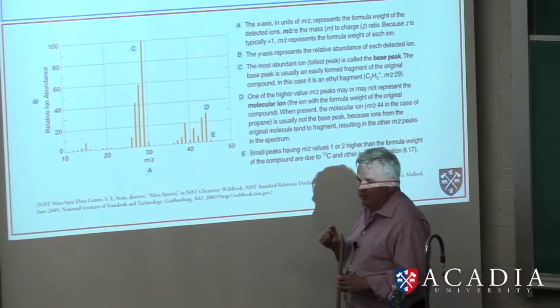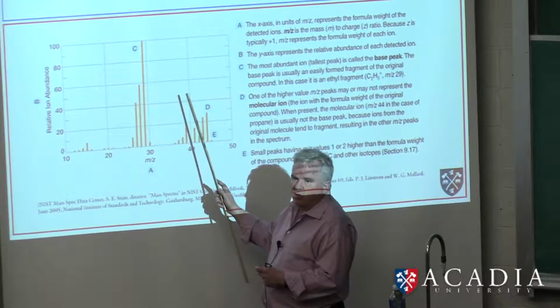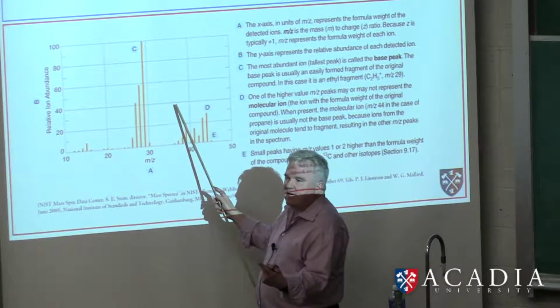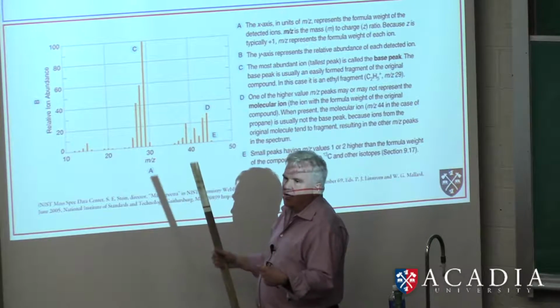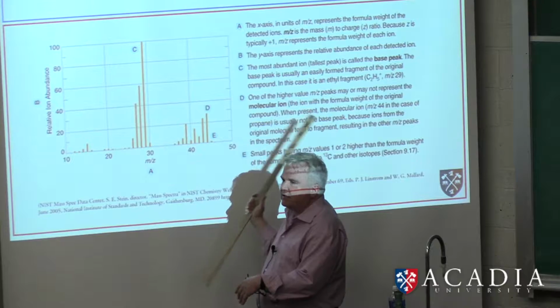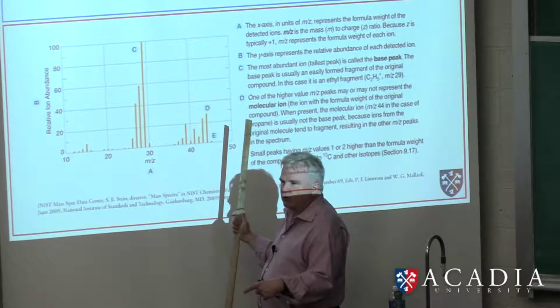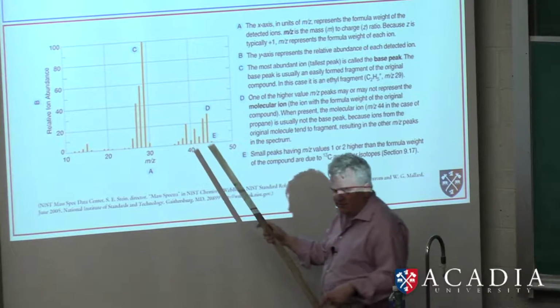Some of those things will be charged, and if they are positively charged, we will get a hit on our detector from those positively charged things. The things that are neutral, we don't see. They just run into the side of the mass spectrometer. They don't make the turn. Okay? They don't turn left when they hit the magnetic field.